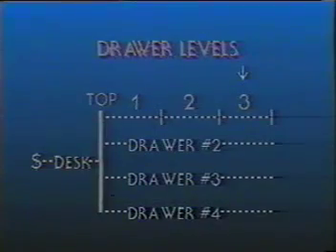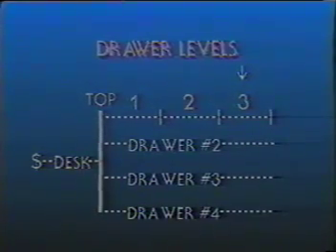Sending the cursor to the lowest level of the drawer reveals a white line below each cell and fluorochrome subheading. This is the pipetting line level of the drawer. Each cell and reagent that you insert will receive a separate pipetting line on each card. Since this protocol has not yet been filled in, the pipetting lines are blank. The vertical flat commands move the cursor from card to card.